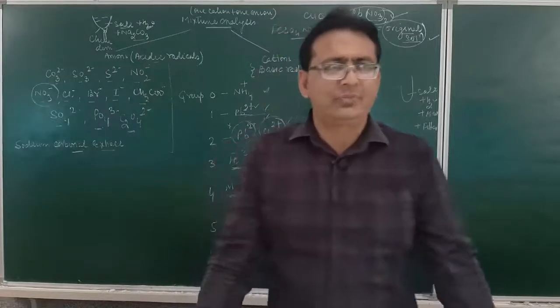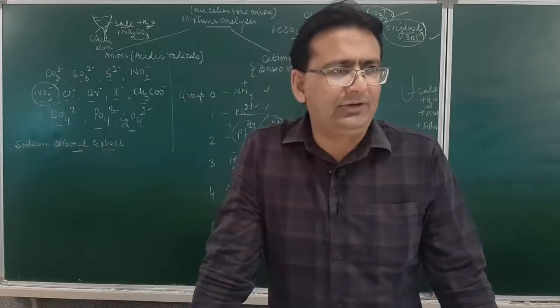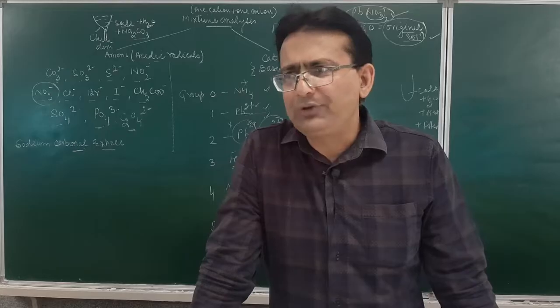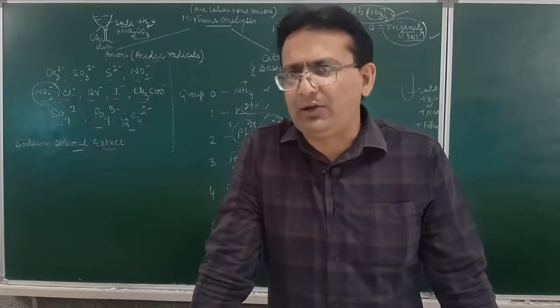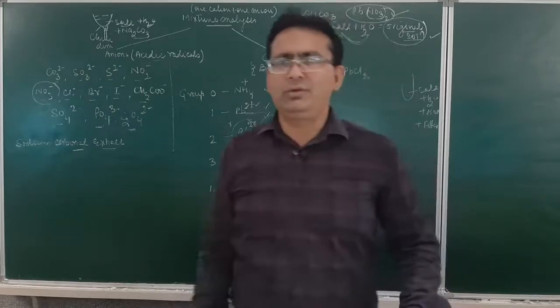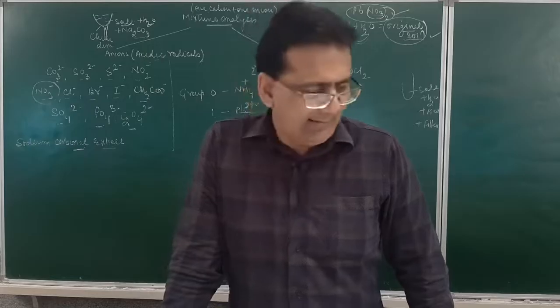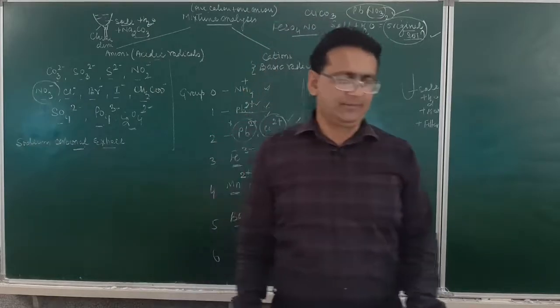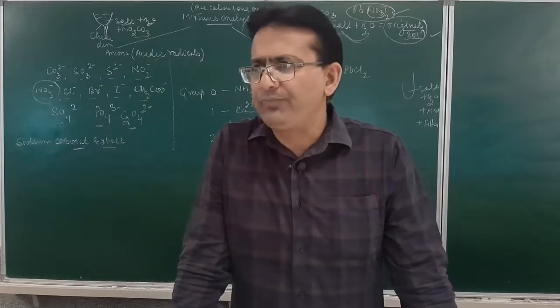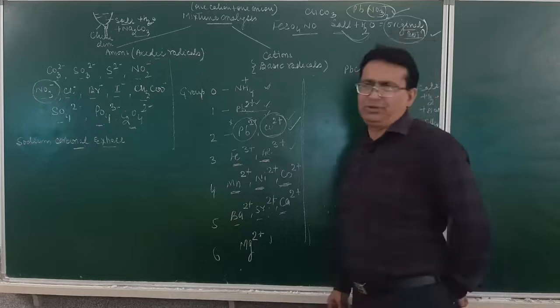Good morning, students. By now you must have seen that we have done two types of practical with you. The first one was the titration, in which we did ferrous ammonium sulfate versus KMnO4 and oxalic acid versus KMnO4. The second was the organic analysis, in which we did various types of organic compounds. Now today we will be doing mixture analysis with you, students.